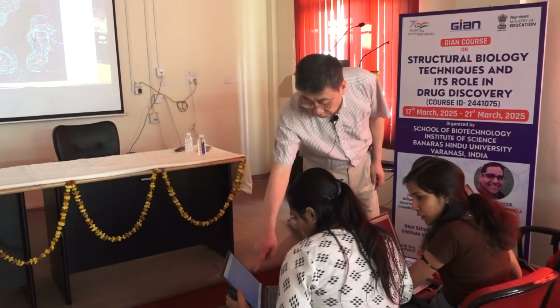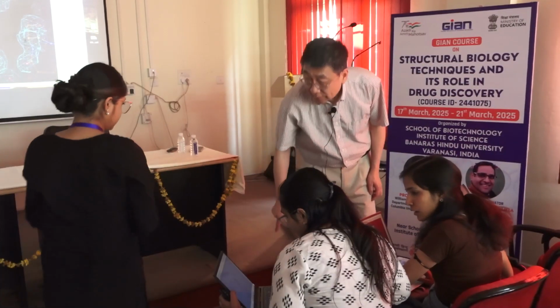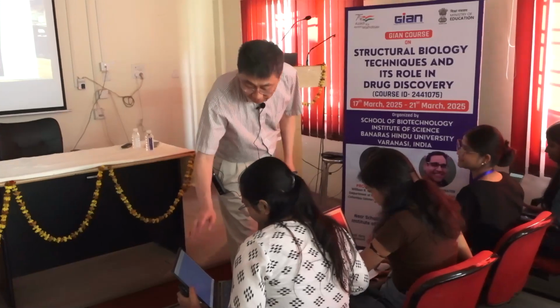And then you change the contour level, scroll. No, you don't have a mouse. So, yeah, right here, you can see the number up there. So make that 1. Go ahead. Yeah, front is better. Make that 1-ish.